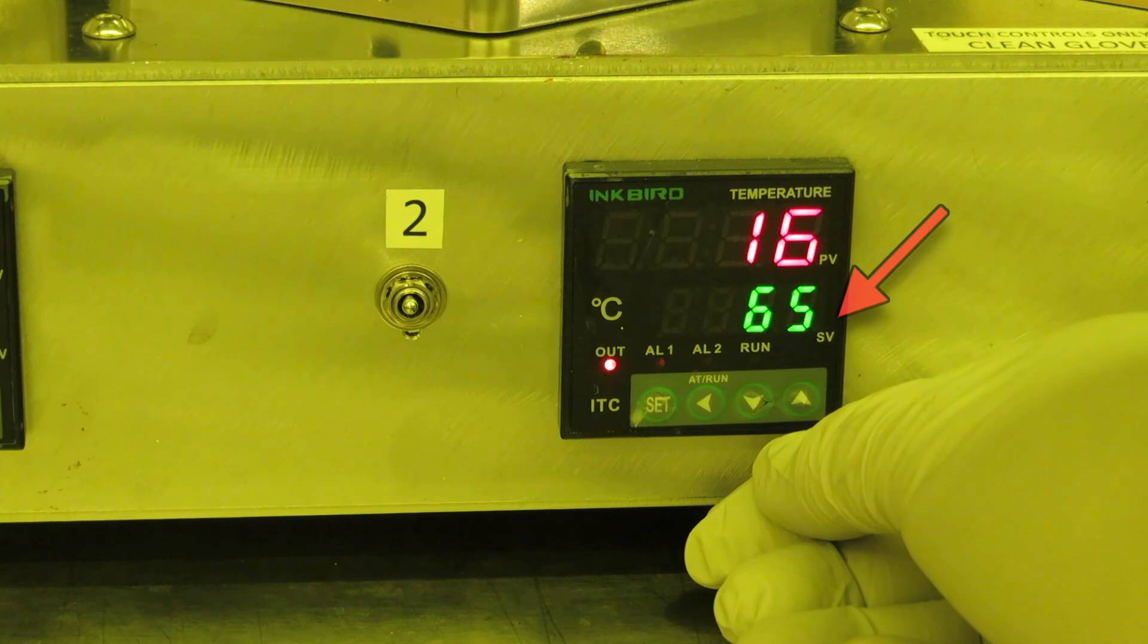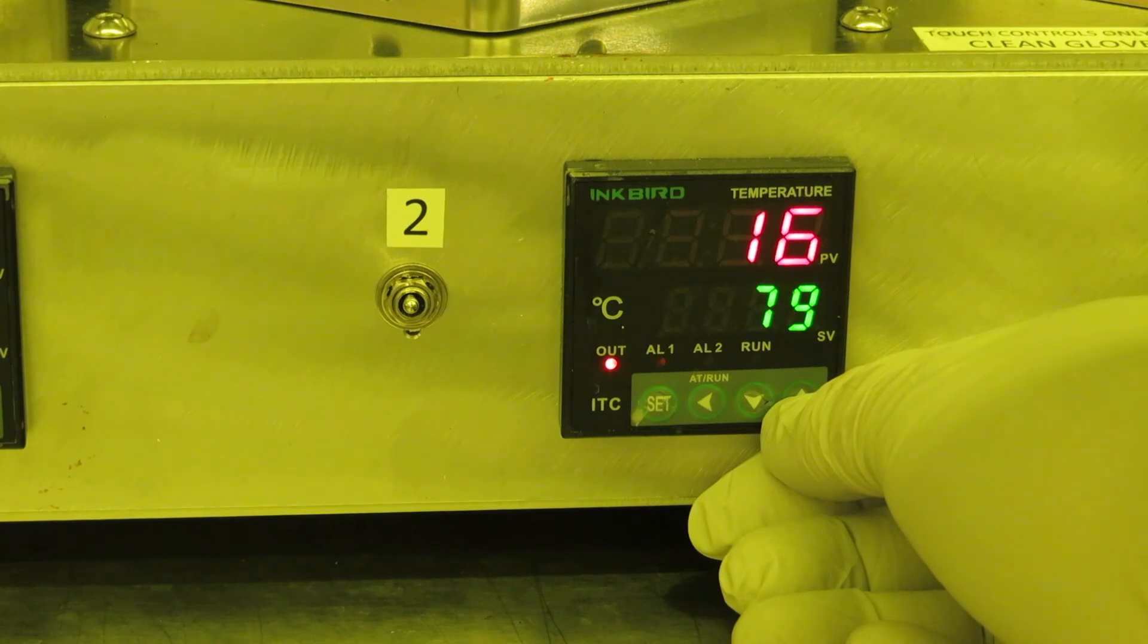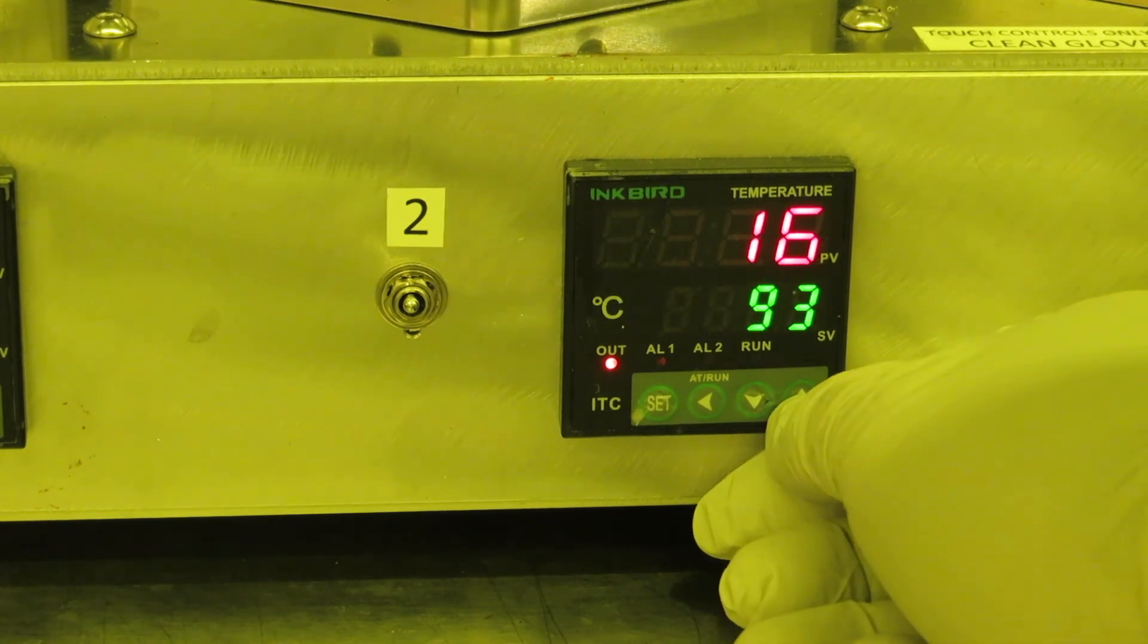To change the set point, push one of the up or down keys until you see the little blinking light, then use the up or down keys to set the temperature that you want. Make sure your gloves are clean and dry before touching any of these buttons. Also try not to touch the other two buttons or you may change some settings.